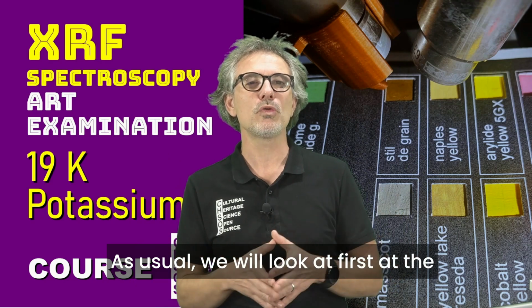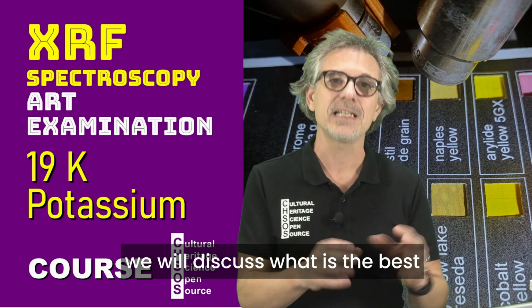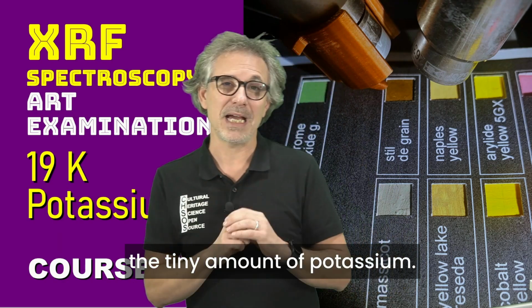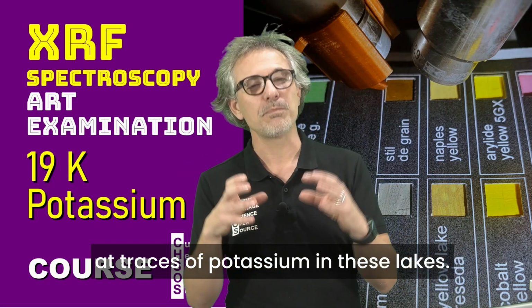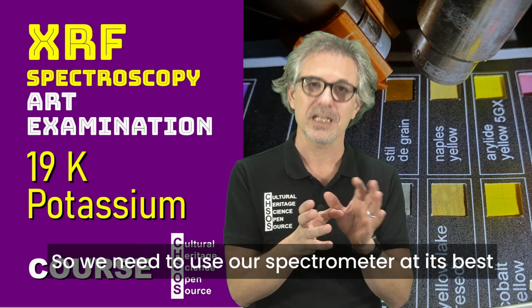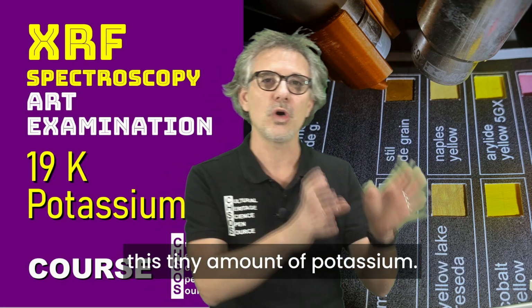As usual, we will look first at the characteristics of its X-rays, and we will discuss the best experimental setup for our spectrometer to detect the tiny amount of potassium. This is important because we are looking at traces of potassium in these lakes. Generally, potassium is not the main component, so there will be just traces. So we need to use our spectrometer at its best in order to detect this tiny amount of potassium.